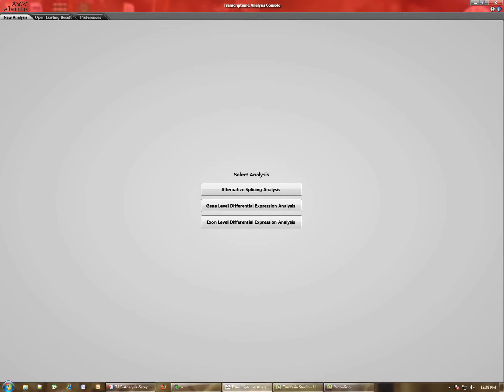When you launch the Transcriptome Analysis Console software, the TAC software, this is the page that you'll be first taken to. There are three tabs at the top.